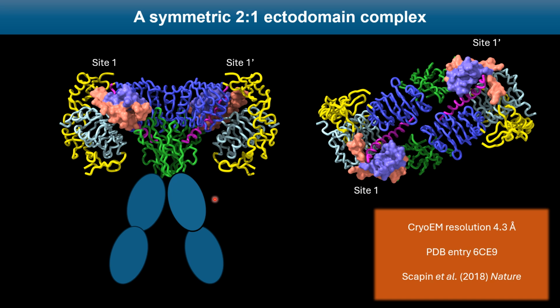The third problem that arose from this structure was that although we now see insulin engaging another element of the receptor, the surface that involved was actually not what we had always believed to be the second receptor binding surface of insulin. So this was quite astounding, but it raised a whole set of questions.